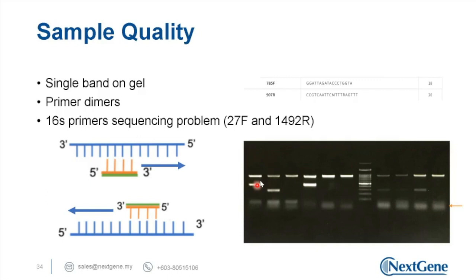Let's say this is the same reaction as this one. So we excise this particular band, and then we excise this particular one. We heat them for melting and all that. But when we load, we try to see whether we can load both reactions into the same column.